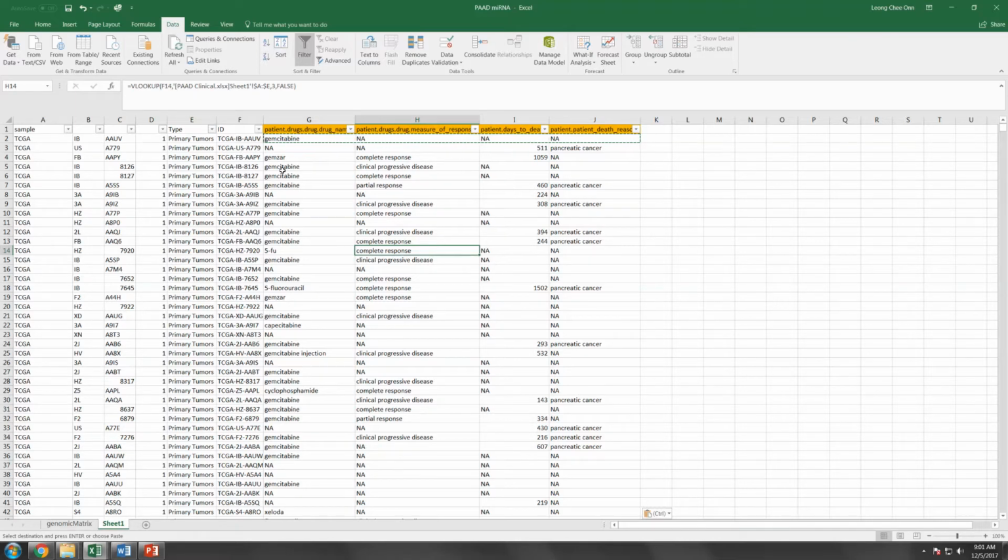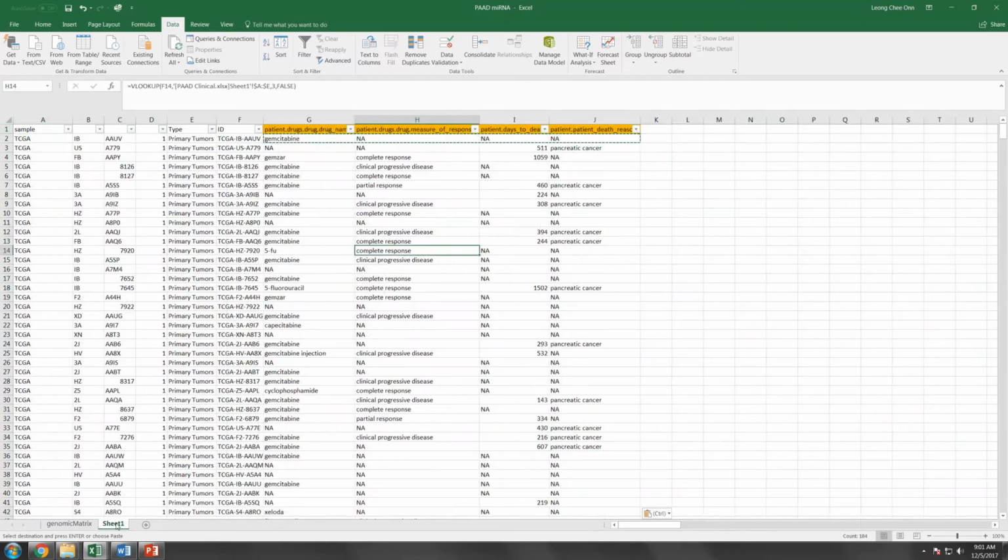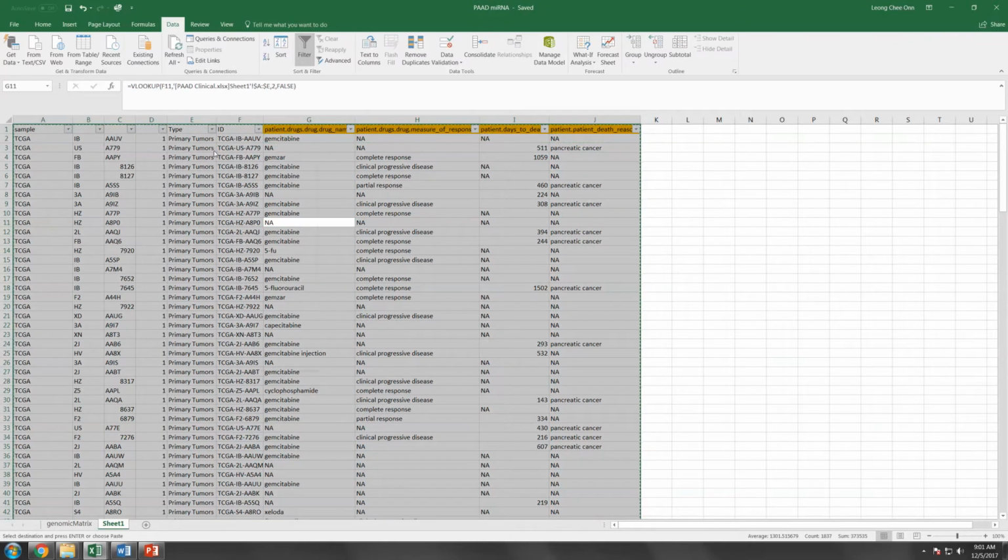It's not done yet. Next, I'm going to overlap this into this big table so that you can filter out some of the information later on if you need to. I'm going to save this for the time being, and then again copy and paste it as text.